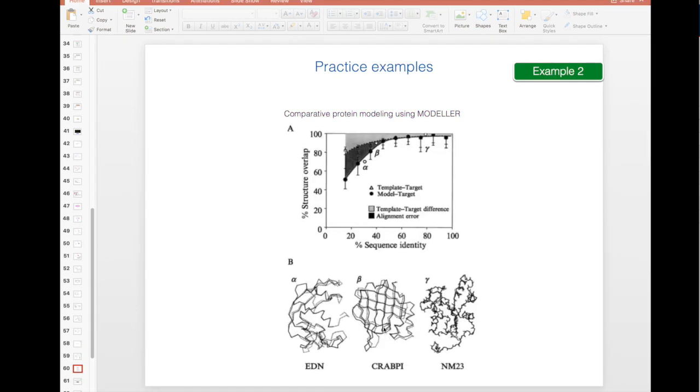Since this is comparative homology modeling, you can see that the more sequence identity you have between your sequence and your template, the better the results.